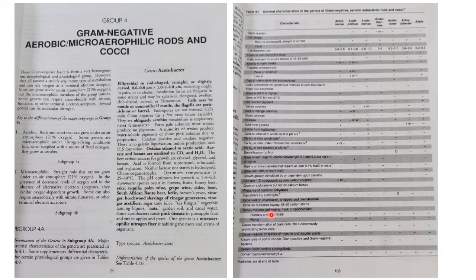So you have to perform these biochemical tests and then report your results, open your Bergey's manual again and compare your results. Which biochemical tests gave you positive results, which gave you negative results, and you need to compare and identify that yes, my results match a particular genus, say Acinetobacter.